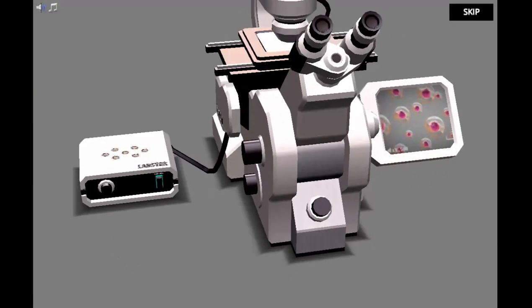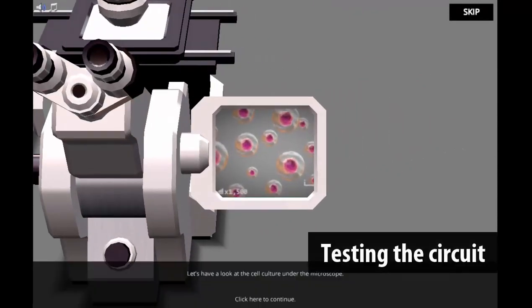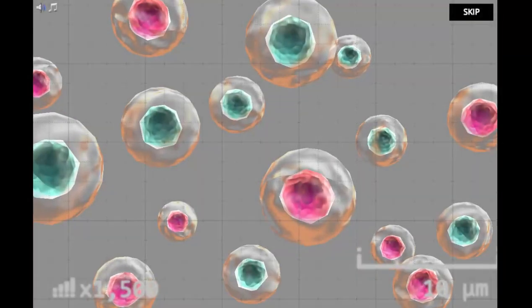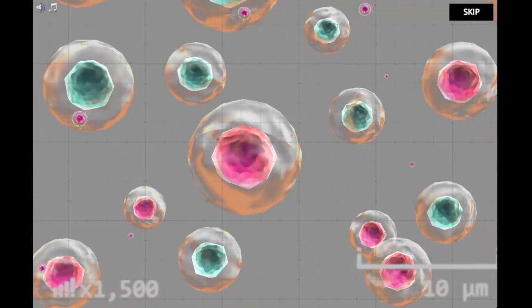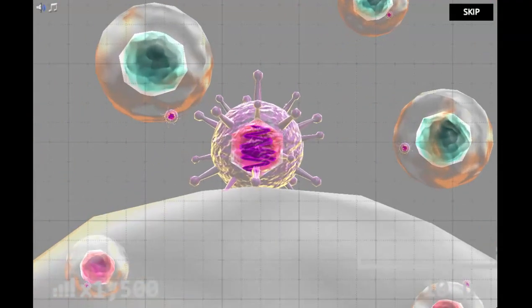At the end, students will test their circuit in living cells to see if the cancer cells indeed are the only ones that die. Will they be able to find a cure for this rare form of cancer?